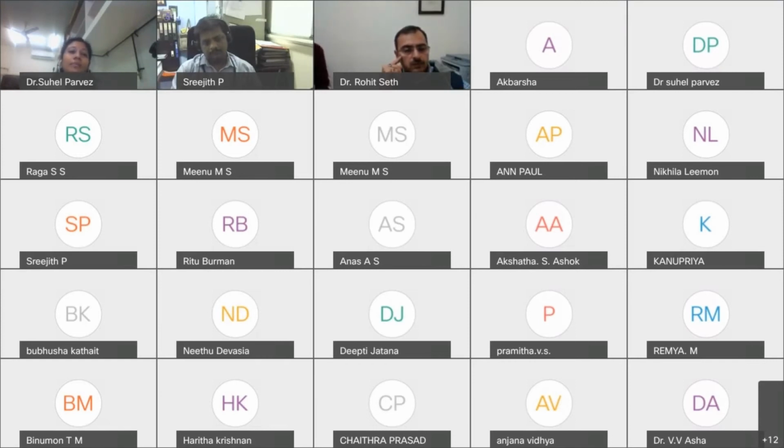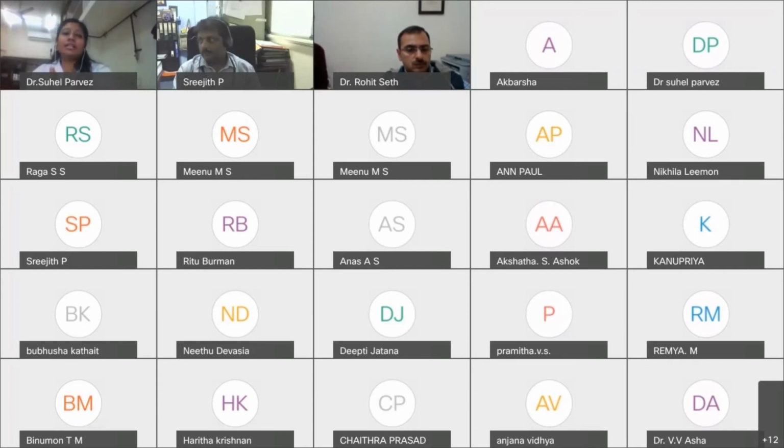So this is the table time for getting the flies from all over wherever you want. And for the culturing, do we need a specific facility, or can we actually use some place in our lab? No, sir. We have a stereo zoom microscope and a BOD incubator, which come in different sizes. We have the 1000 liter BOD incubator.